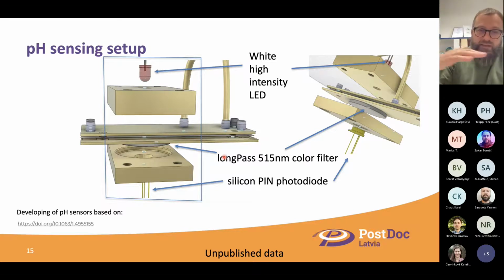As I told you, we are placing these cells on a polycarbonate membrane, which is not very biocompatible. Yes, it's compatible, but still we need to enhance that, to grow or to seed on such a substrate. We are still developing the protocols for how to attach these cells on this polycarbonate membrane. More or less, it's already done. We have a protocol, and seeding the cells is one challenge, but there's another.